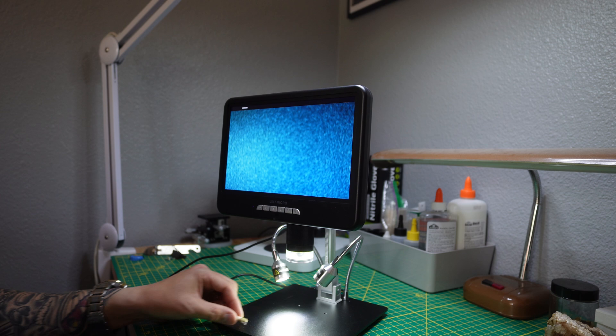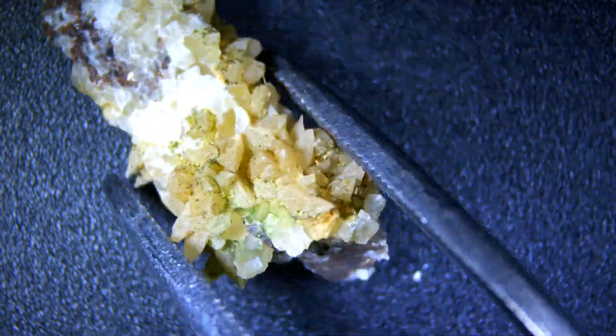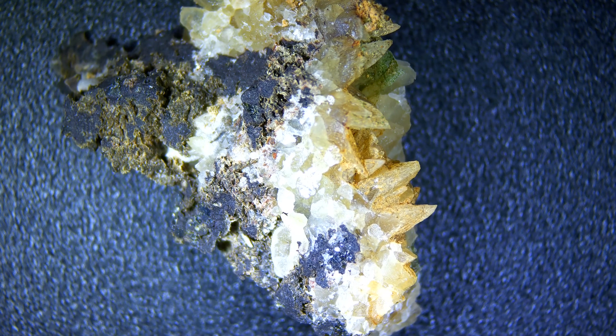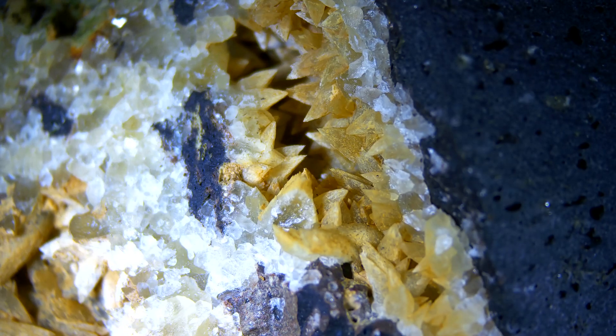Let's grab these little guys and see what we have. You don't need to place things with tweezers, but once you get something like this and look at your fingers under a microscope, you won't want to show that publicly. You can see here we do have some green moss growing on it, which is to be expected — I didn't clean the organics off. And already I have a pretty good idea of what we are looking at. We'll look at a couple more to double-check and make sure there's nothing that's an outlier. If you have a clue what this could be, go ahead and drop that down below. Let's take one with some pointy bits. Okay, that one's pretty good, especially right there.